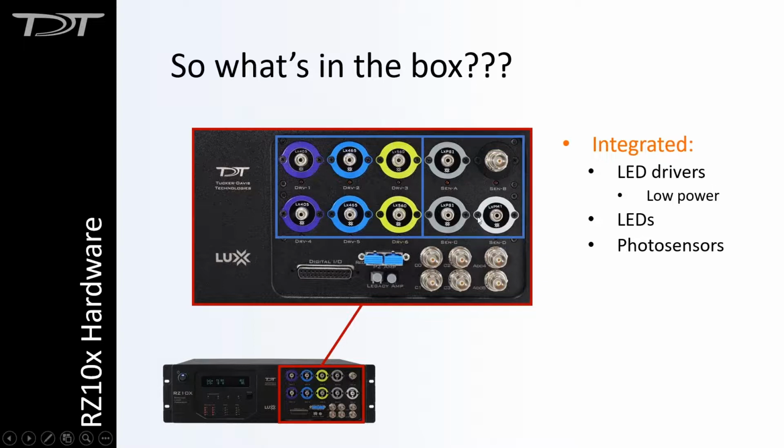Now the next section over here are our photo sensors. So we can have up to 4 photo sensors connected. And in this panel too, since this is our analog input, we also have our power meter. I'm going to explain in greater detail the power meter at a later point in the presentation, so we'll just pause on that explanation for the moment. And then finally, for any slots that are not occupied, we'll simply populate them with a BNC connection or an MA8 driver, so you have access to these channels just as standard analog outputs and analog inputs, so you have the ability to access that as well.